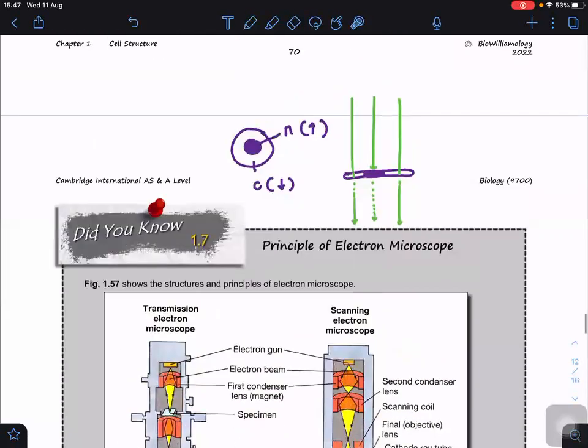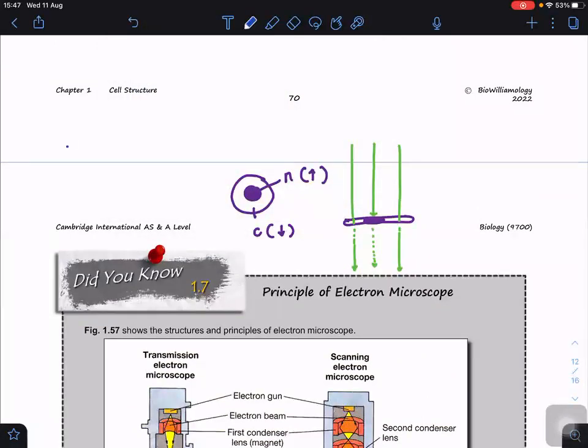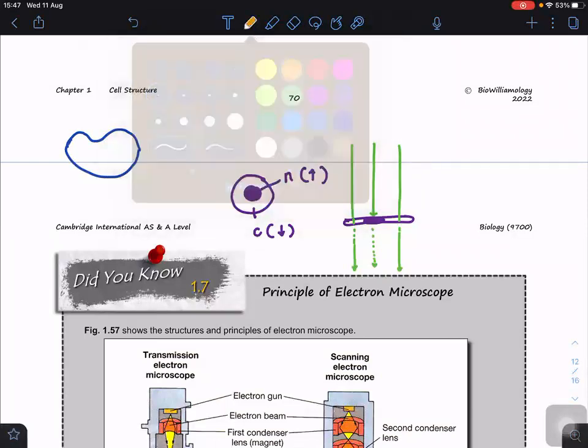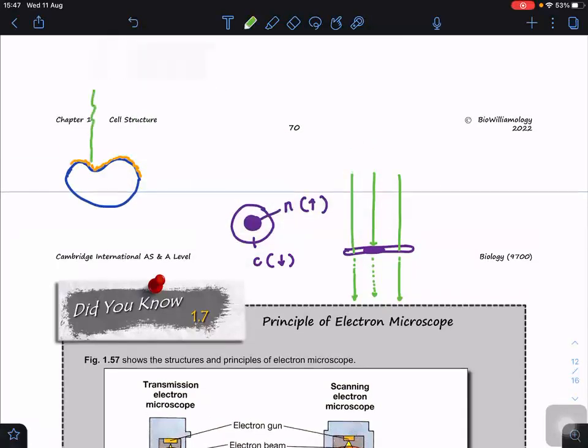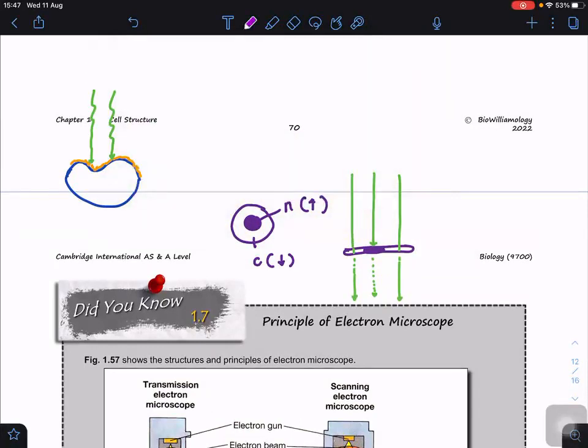So what will happen here is, now look at this. Let's say this is my specimen, the shape here. We coat it with the gold particles. Then we let the electrons bombard it. When the electrons come and bombard my gold, because the electrons have high energy, it helps to generate what we call the secondary electrons.